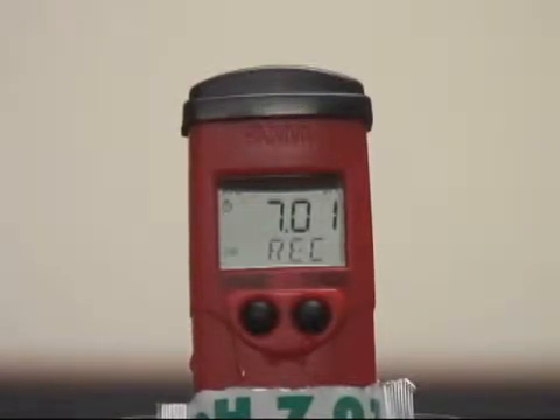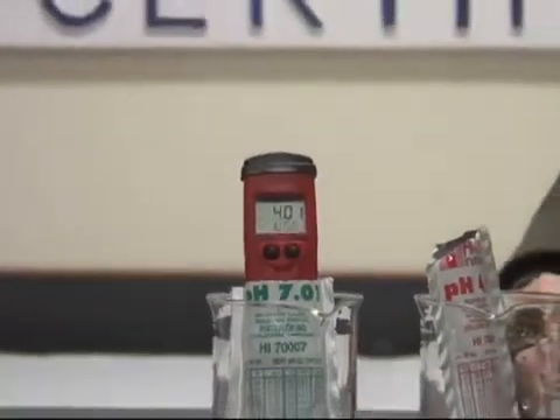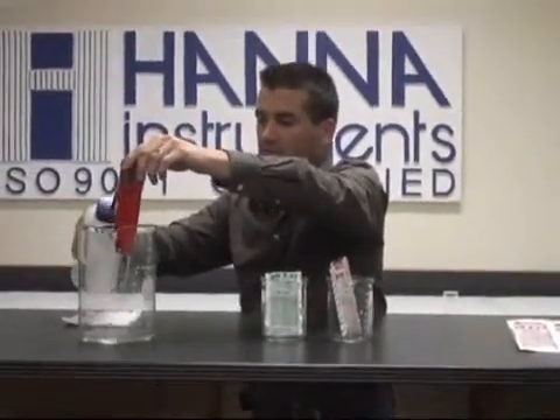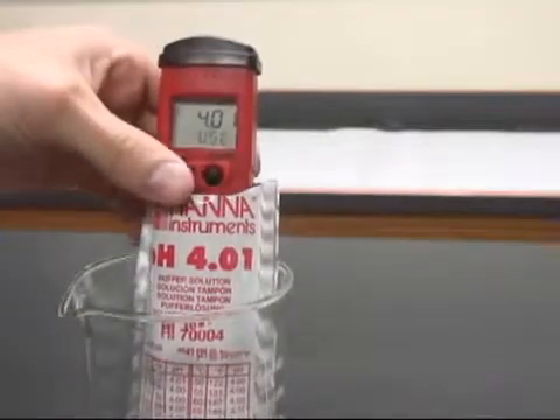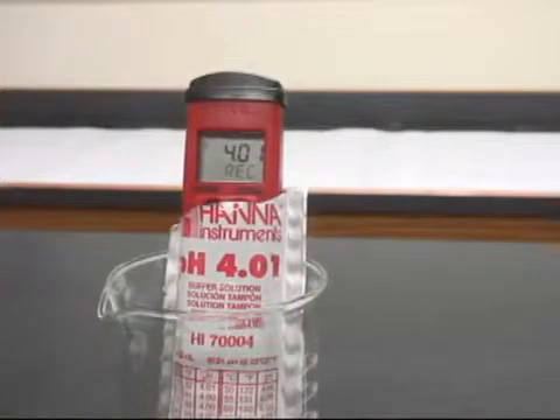Once the tester has accepted the calibration automatically, you'll see it request 4.01 buffer. When it has accepted that calibration automatically, you'll see it jump right back into the normal measurement mode and you're good to go.